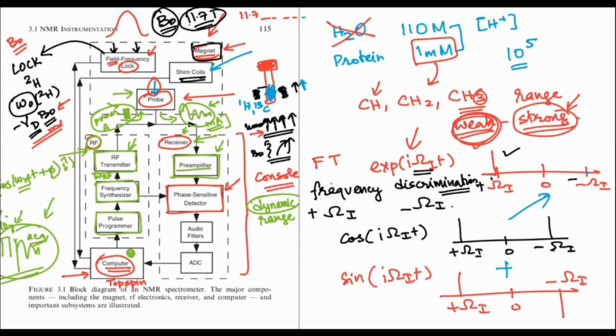So this is a very important aspect where the omega RF that you had put in is actually subtracted from it. Remember, your signal is within a spectral width, and wherever your carrier was, you shifted it from the spectral width plus omega RF. So you just subtract the omega RF, which is why this feedback is required depending upon how much you added. You subtract that to get the spectrum within the range that you have.